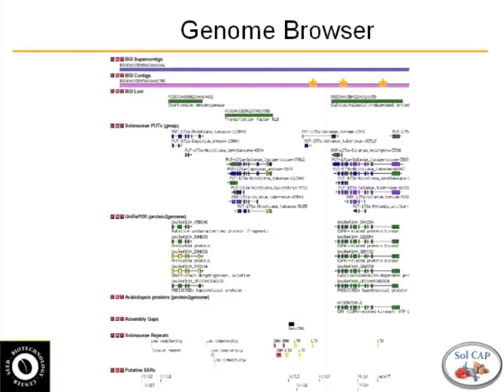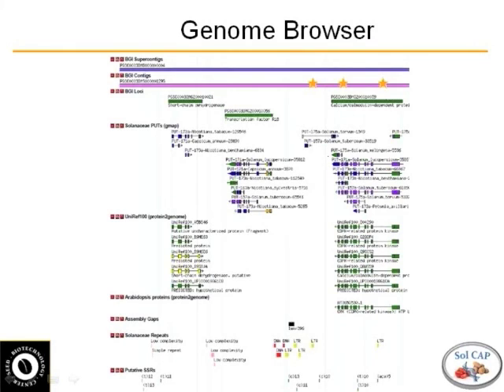The genome browser is a good way to look at where your SNPs come from — you can look at markers and where they're highlighted. What's nice about the genome browser is you can really add any information you want; you're not limited to what you see here. You can add bands on and off by clicking them on and off. If you want to see the genetic map across this, a high-density genetic map, you can do that. Heather showed how you can just click things on and off.